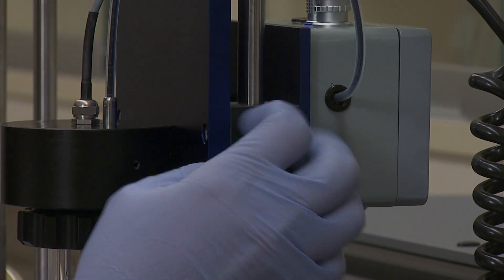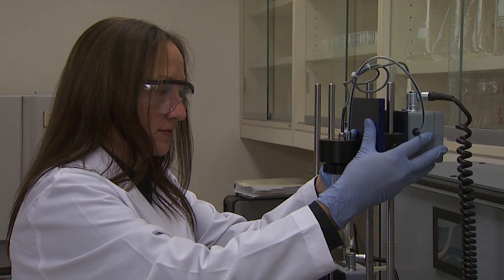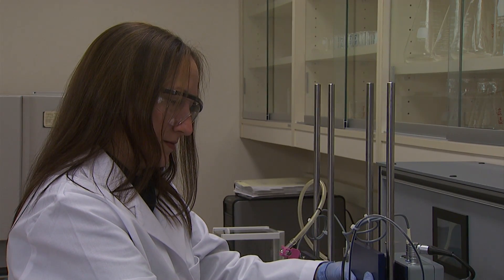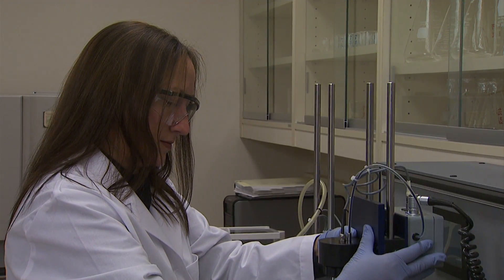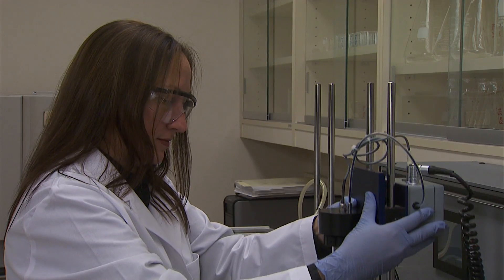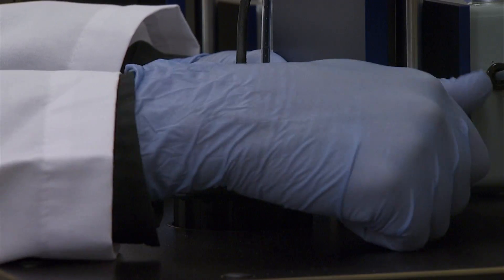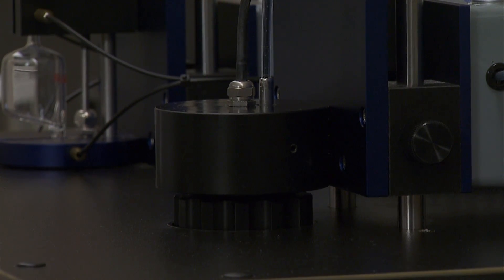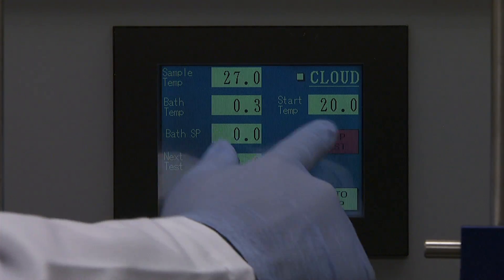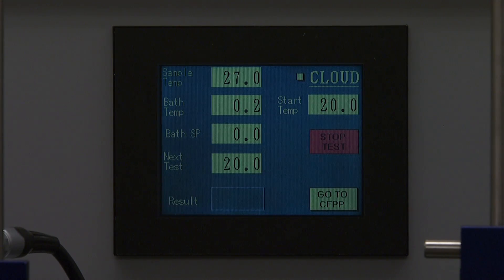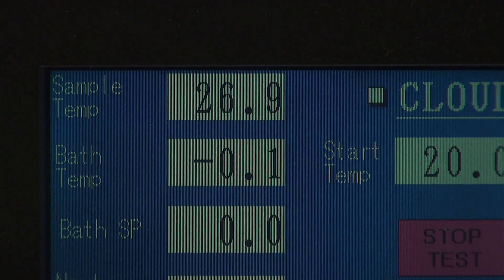Carefully thread the plastic collar onto the probe area just above the jar. Use the black knob to the right to loosen the sample assembly while firmly holding the sample assembly with the other hand. This will allow the probe area and the sample jar to be raised and lowered into test position. Carefully lower the entire sample assembly until the tube is lowered completely into the test chamber. The bottom of the plastic collar should fit securely against the top of the test chamber. On the display screen, touch the green area that reads Start Test. The green area should change to red and read Stop Test, and the test will begin immediately.